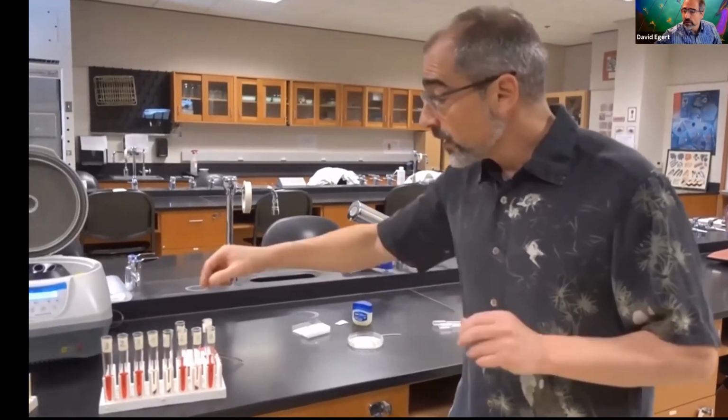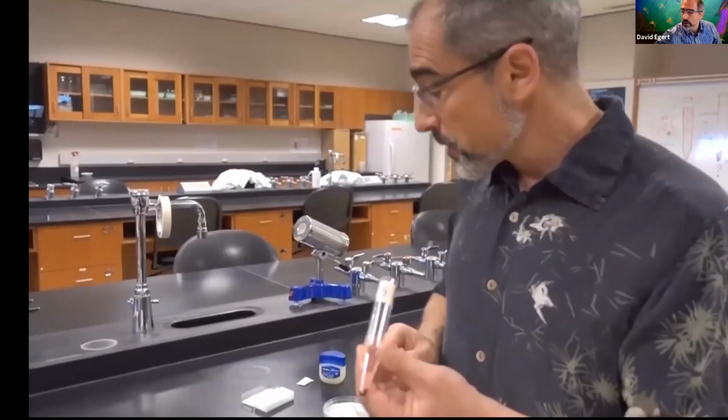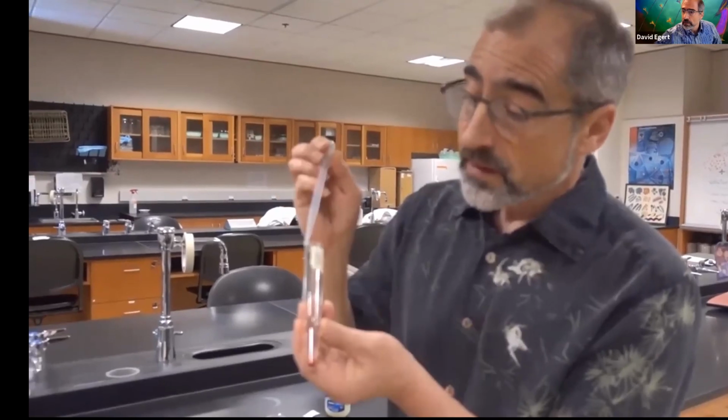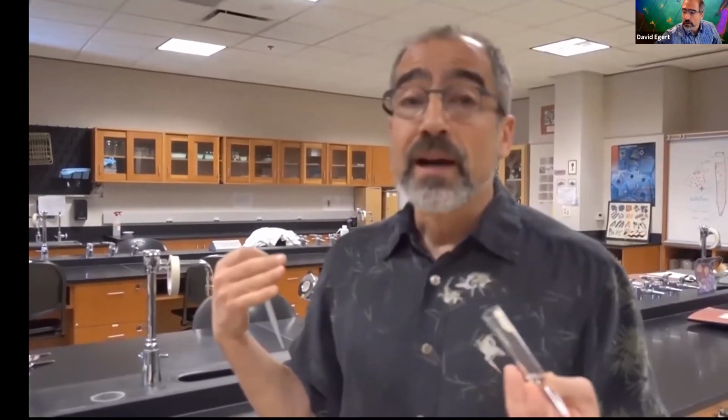So let's say this is test tube 5, where I'm assuming they lysed. First thing you're going to need to do is resuspend the blood cells up in the solution, obviously. You don't want to totally mix it back up. If you put too concentrated blood cells on a slide, it's hard to see any single blood cell. It's like if you're interested in looking at a grain of sand, but you're looking at a whole handful of sand, all you're going to see is just crazy sand grains everywhere.